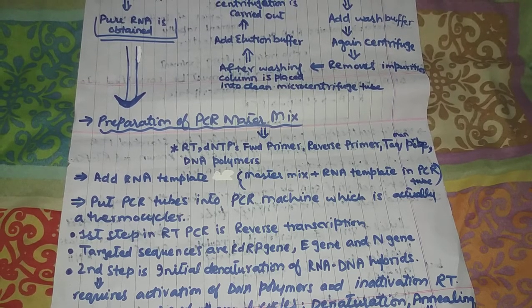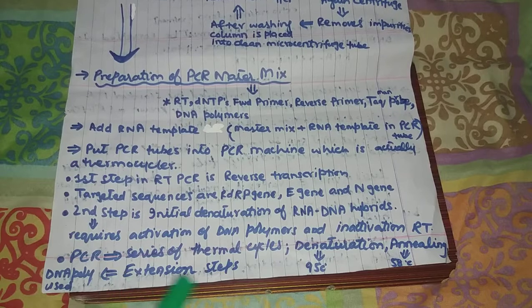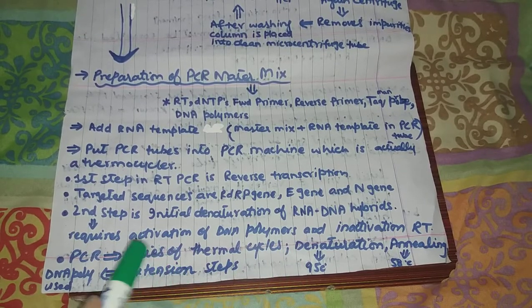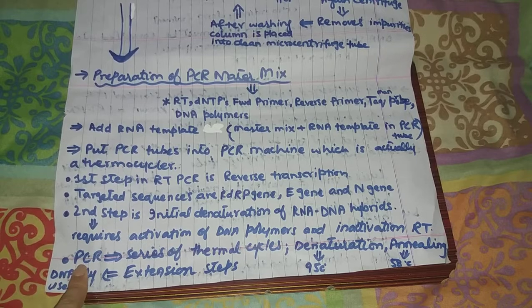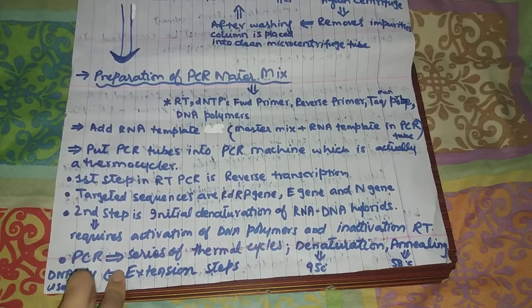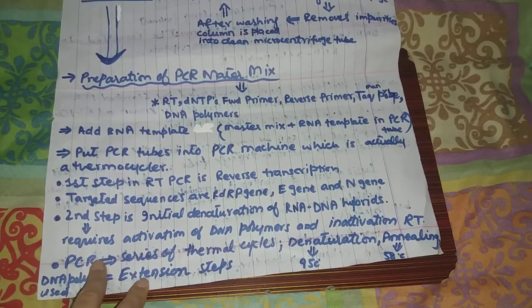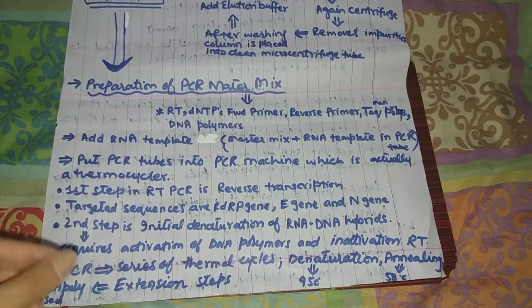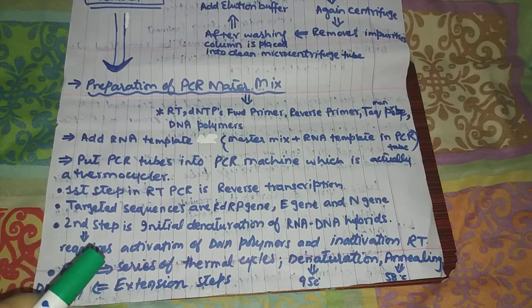So after many cycles of denaturation, annealing, and extension, we will finally get multiple copies of the DNA. And that PCR machine has a camera, known as a CCD camera.